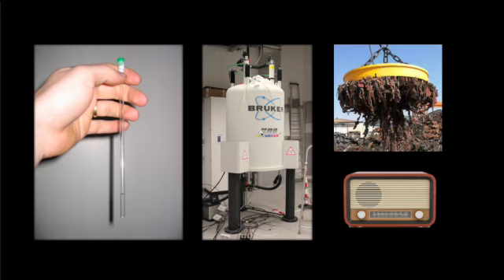And just like you might dial your radio into 98.6 megahertz on your FM dial, you also can get instruments that are called 60 megahertz or 400 megahertz or 600 megahertz NMRs. And those talk about the radio waves we're using. So remember, we have a magnet and we have radio waves. So a magnet and radio waves. Those are the two key pieces.